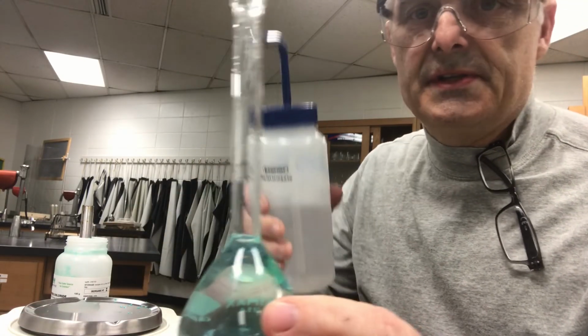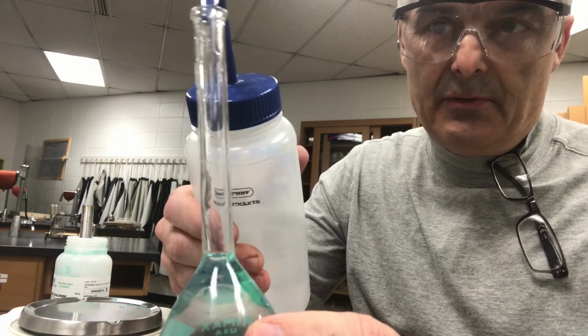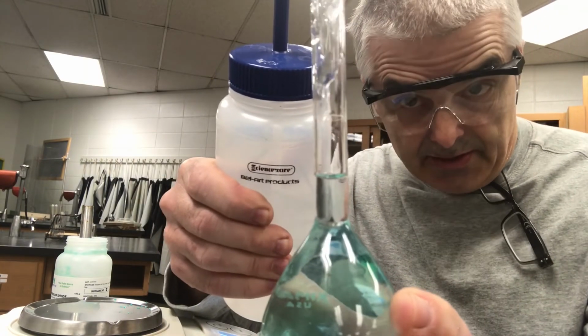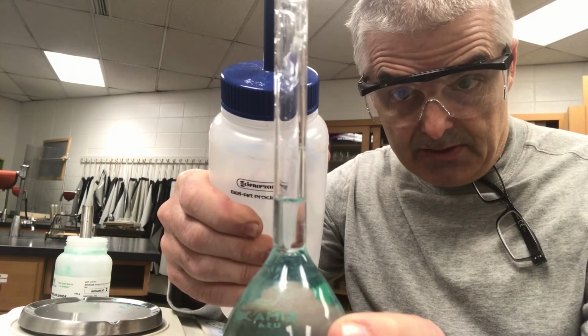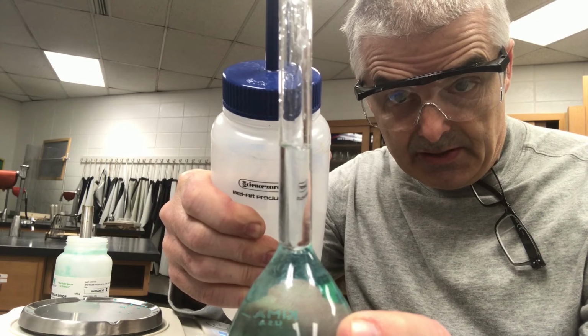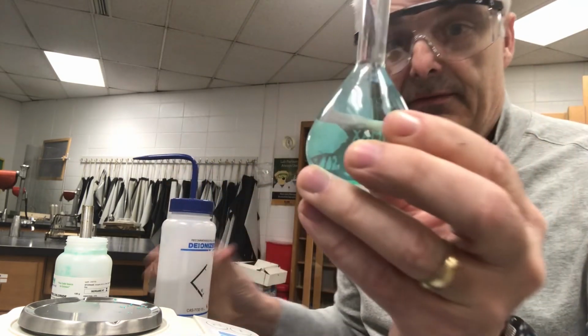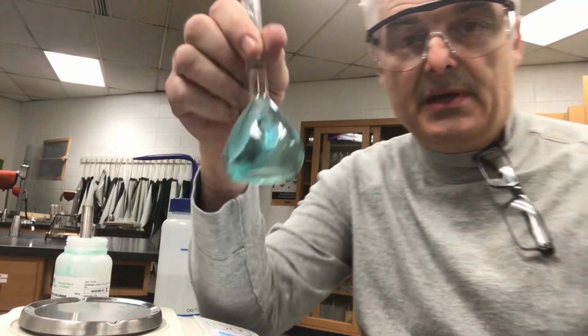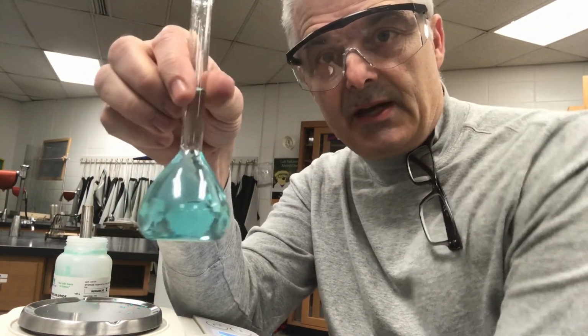Once I get towards the tip, this is what I want to do, I want to slow it way down, and I want to add water right up to the line, and I aim so that the meniscus is at the bottom, right? And there I have made a solution. Now it's not completely mixed. I'm going to need to mix it all up, but that's how you make a very specific, accurate solution.